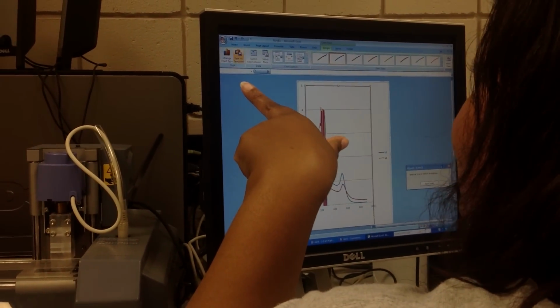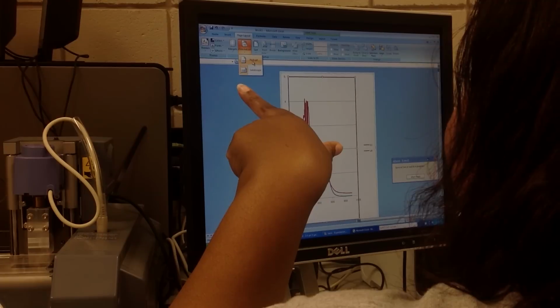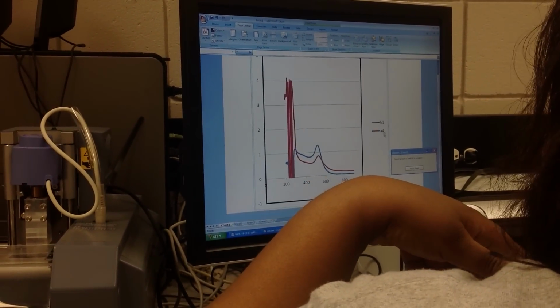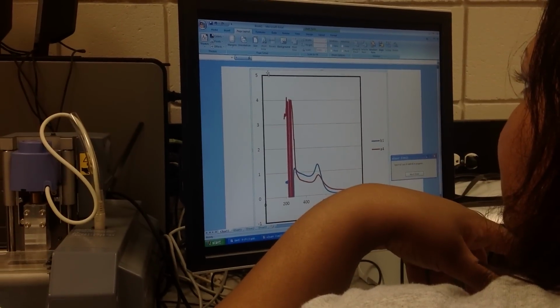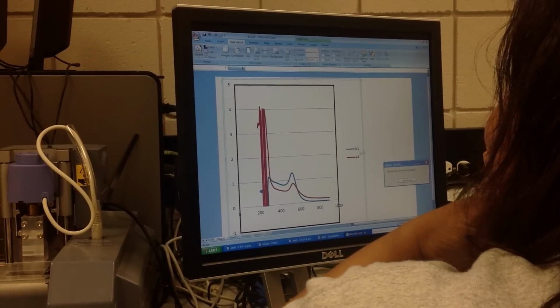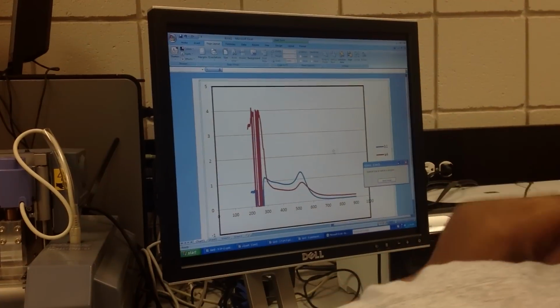Other thing you need to do is make this wider. There's another way to do that, where it's a wide one. Play with that. It should be in landscape. It should be wide. You can bring it out on the side. It's another way to keep from having to do that, but for right now I'm going to do that.